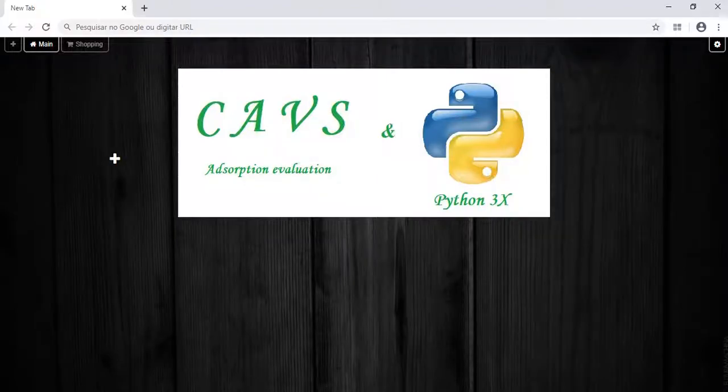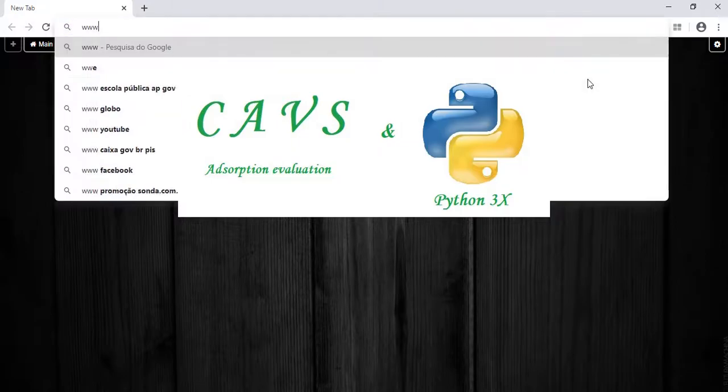Hello everyone, in this tutorial, I will show you how to download CAVS adsorption evaluation. First, go to our institutional website.